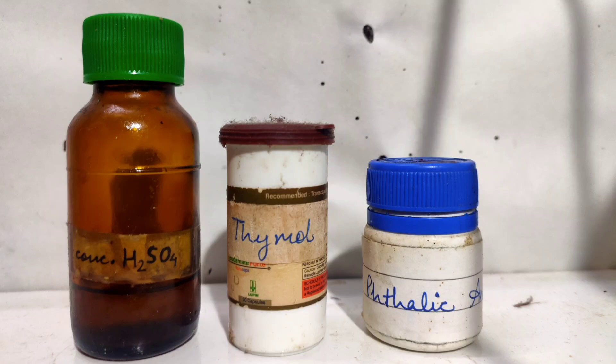In this video, I will be synthesizing thymol phthalein, an acid-base indicator which is often used in making disappearing ink.